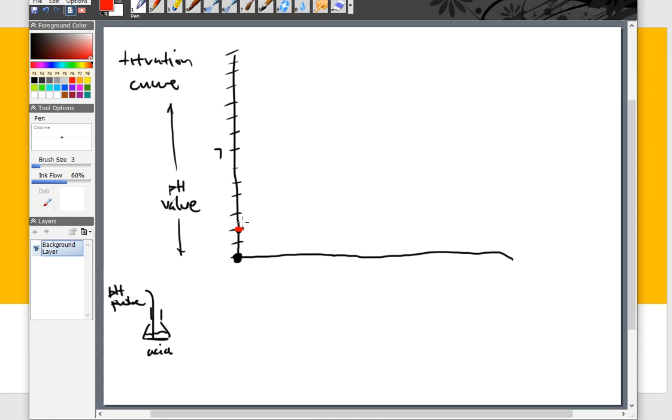Okay, well, the purpose of a titration is to drip, drip, drip, drip, drip down into that flask. Well, if I have an acid down here, folks, that would be kind of silly if I had an acid up here in the burette, right? I can't really react an acid with an acid. It's going to take both. It will take an acid and a base. So the base is probably what's in my burette up at the top. So that base is going to drip, drip, drip, drip, drip down into the flask. The base will react with the acid.